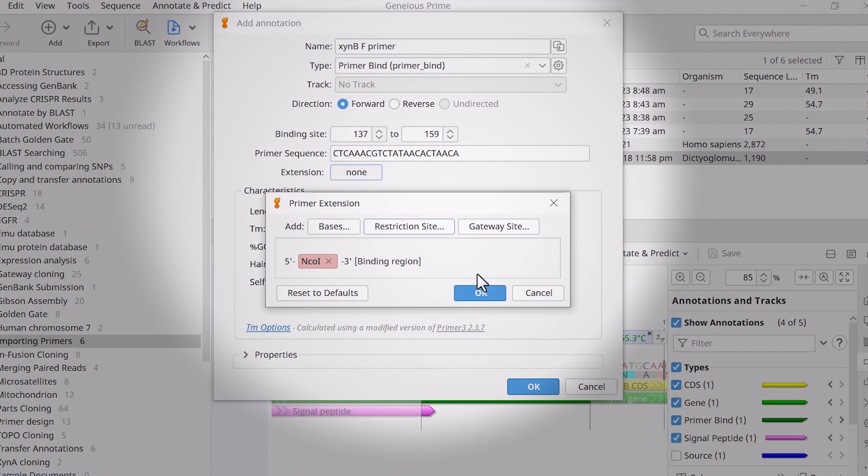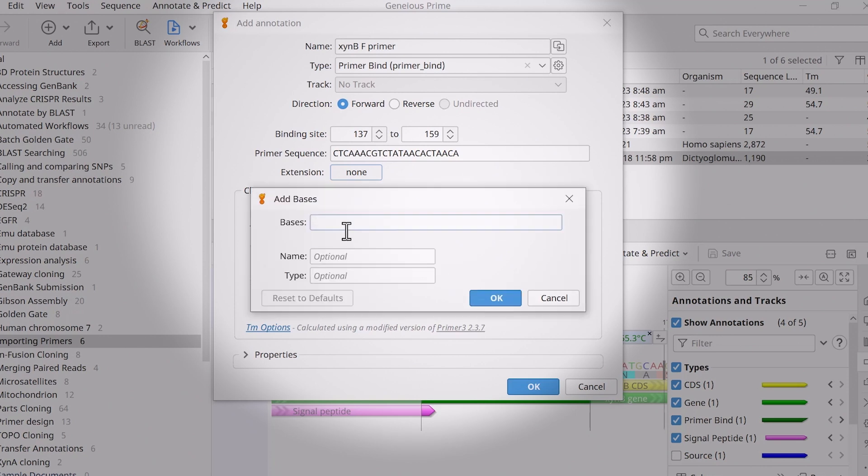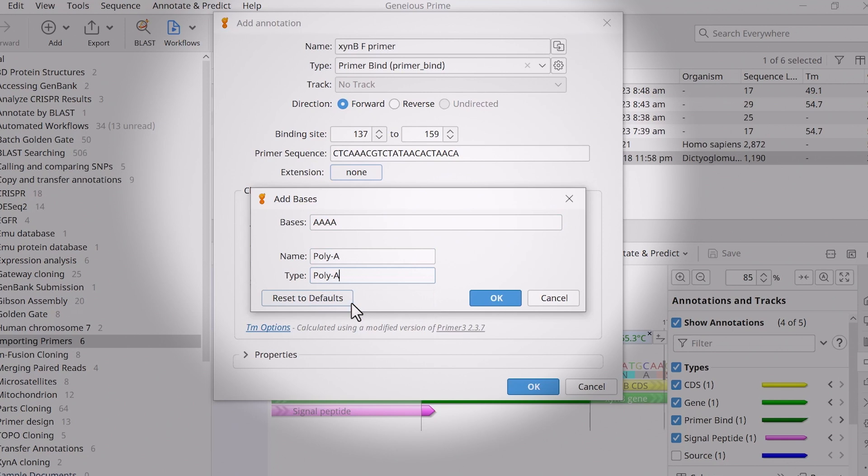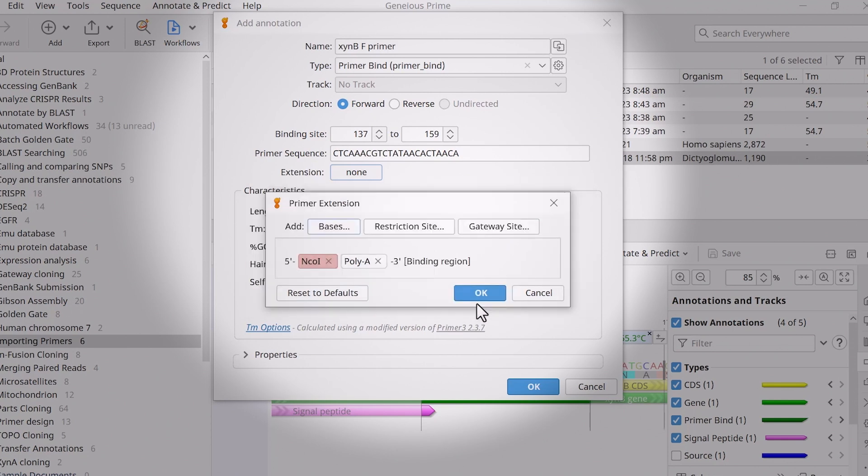If you want to add more extensions, repeat the process. This time, I'll add a custom sequence. Enter the desired bases into the Bases box and give the extension a suitable name and type. I'm adding a Poly A extension, so I will name this accordingly.